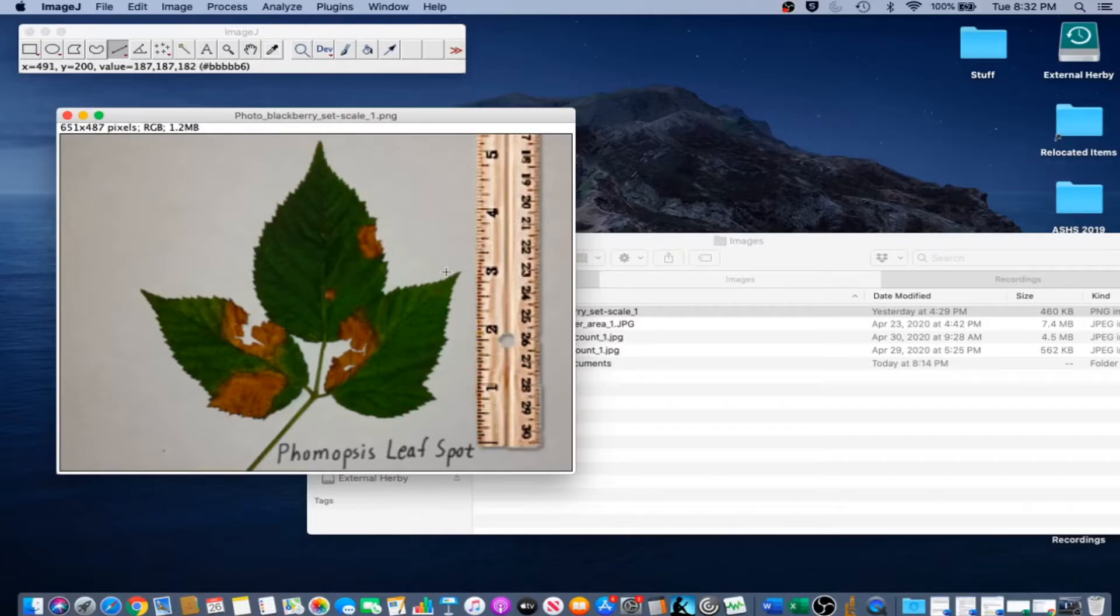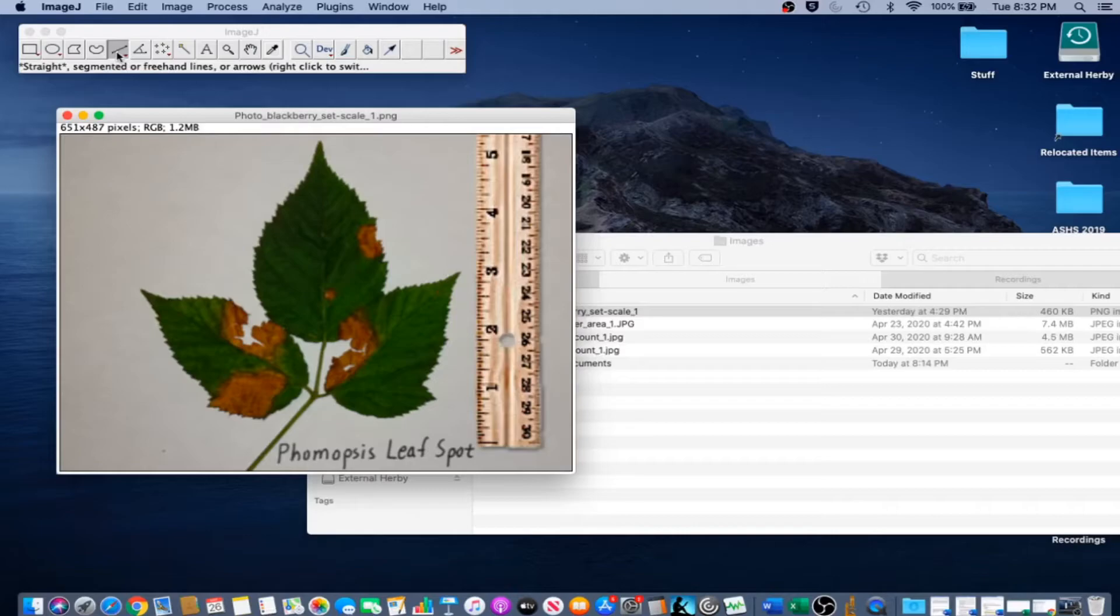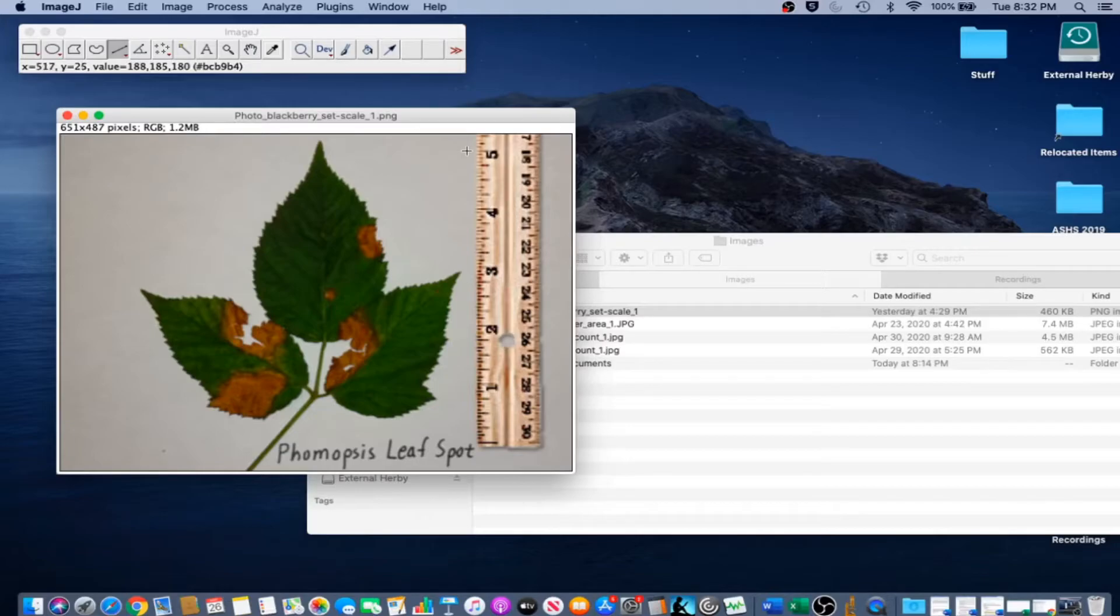Now that the file is open, select the Straight Line tool from the graphical user interface. Draw a line to an object of known size, in this case the 5 inch ruler, holding down Shift to keep the line straight as you do it.